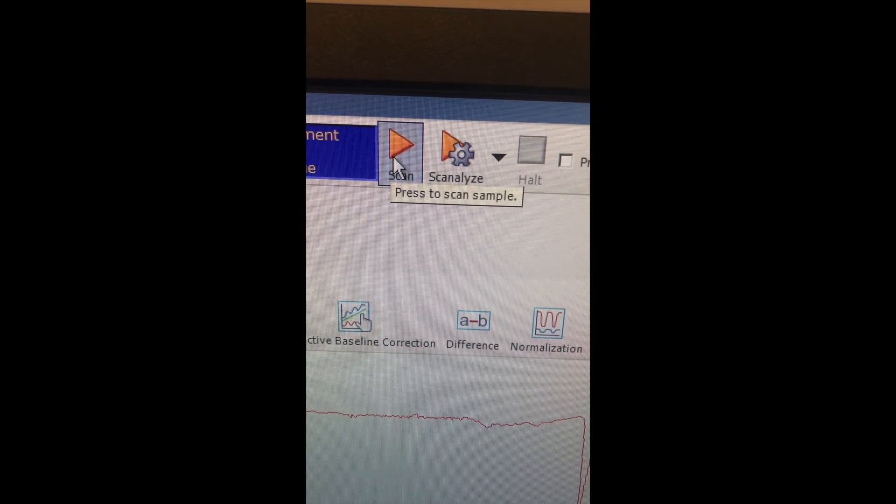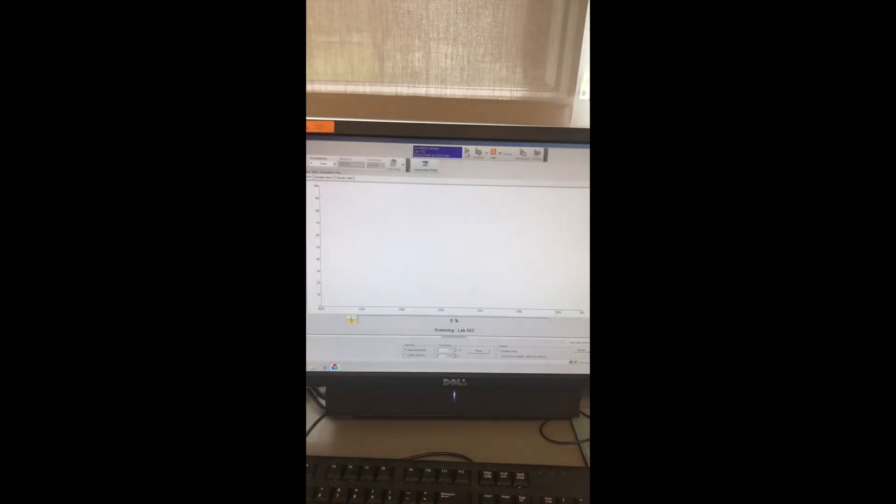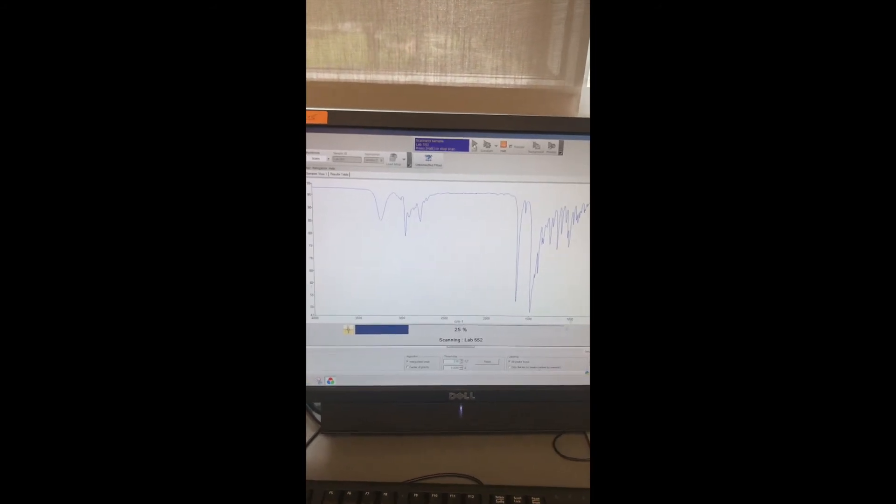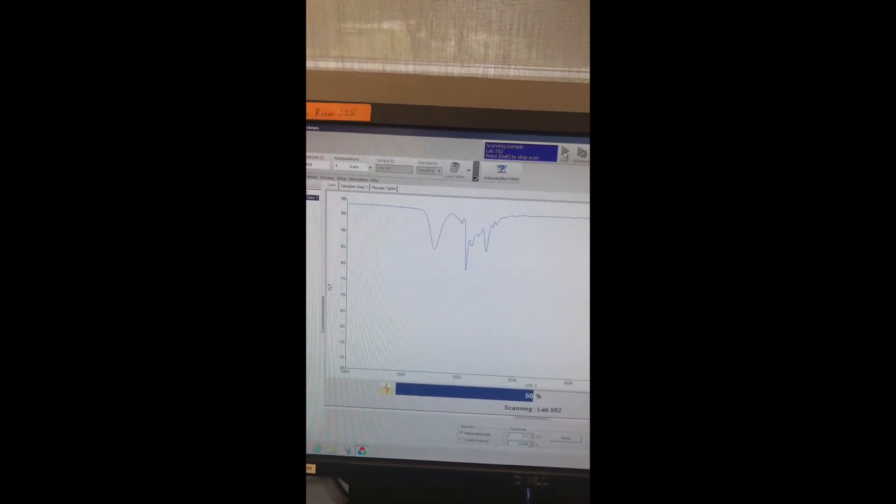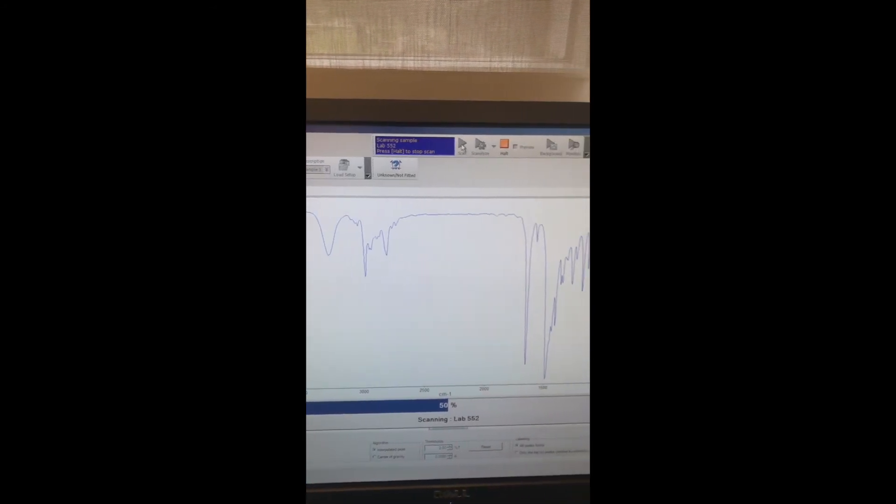Right to the left of the background is the scan, and so we're going to hit the scan icon there, and that starts the scan of our sample. Of course, we're removing the background. Same thing here, it'll display on the screen, but the bar at the bottom will tell us when we're ready. And so once we get to 100%, then our sample will be ready, and we'll be all set.